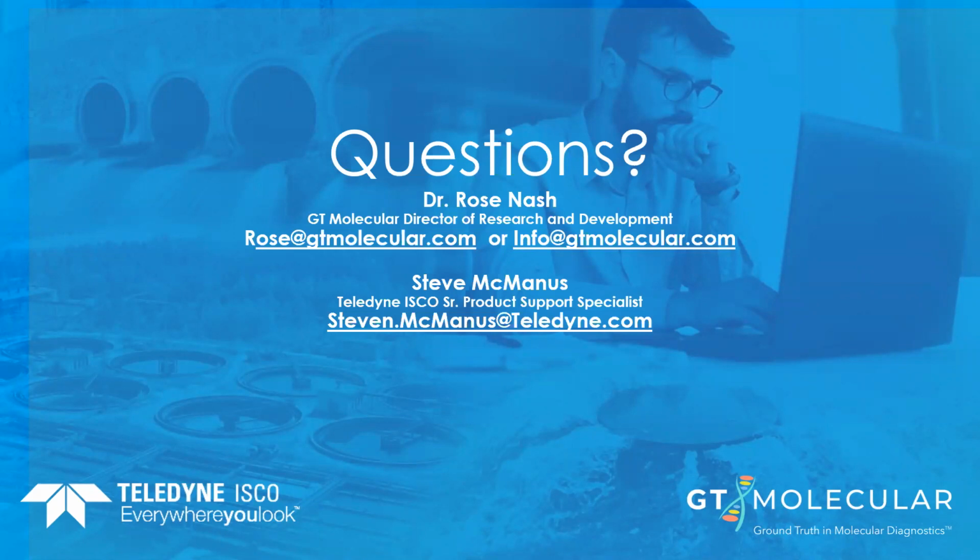If one is unable to know what the flow is, it would be very difficult to be able to devise a flow pace routine, because you don't know, do I pace it every 100 gallons? Do I pace it every 1,000 gallons? If you do not have an understanding of what the typical flows are in that particular application.